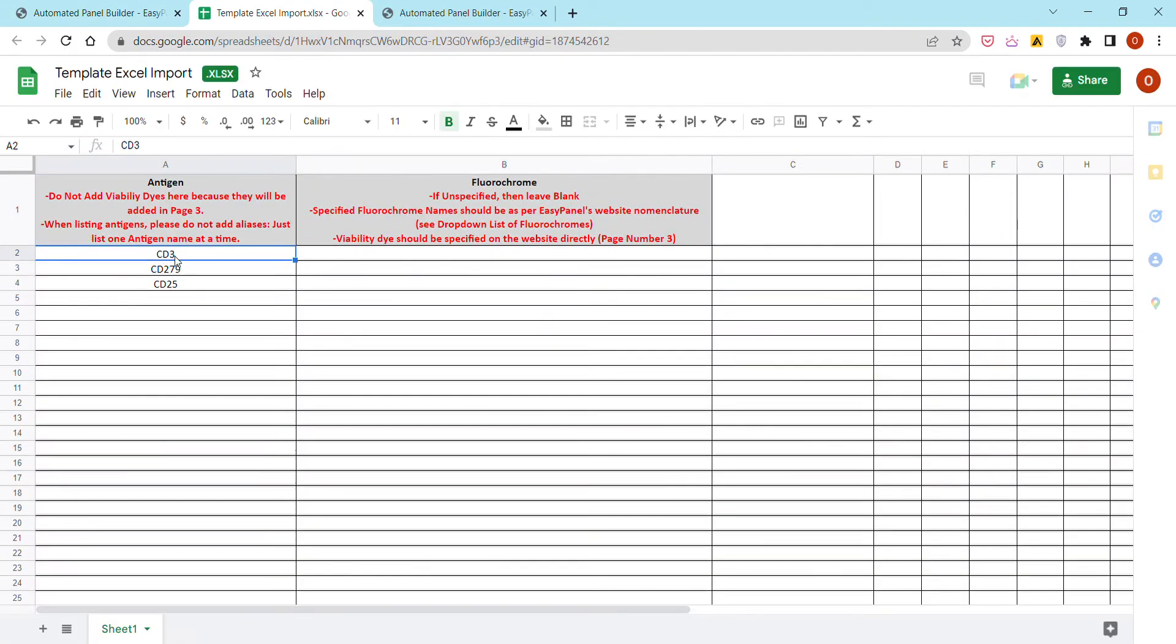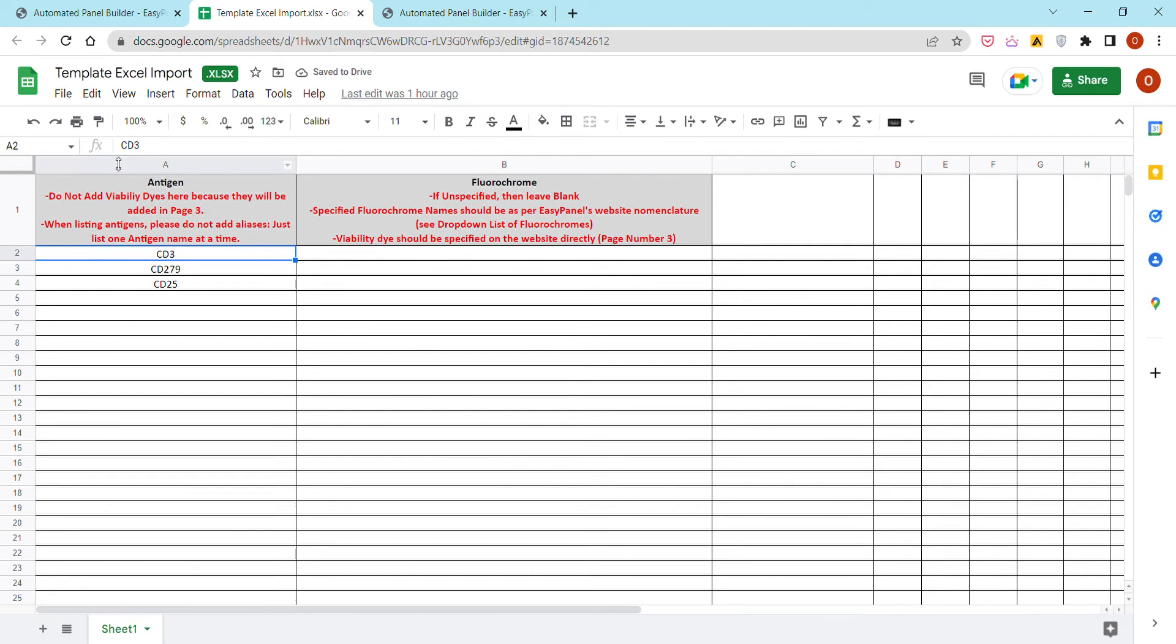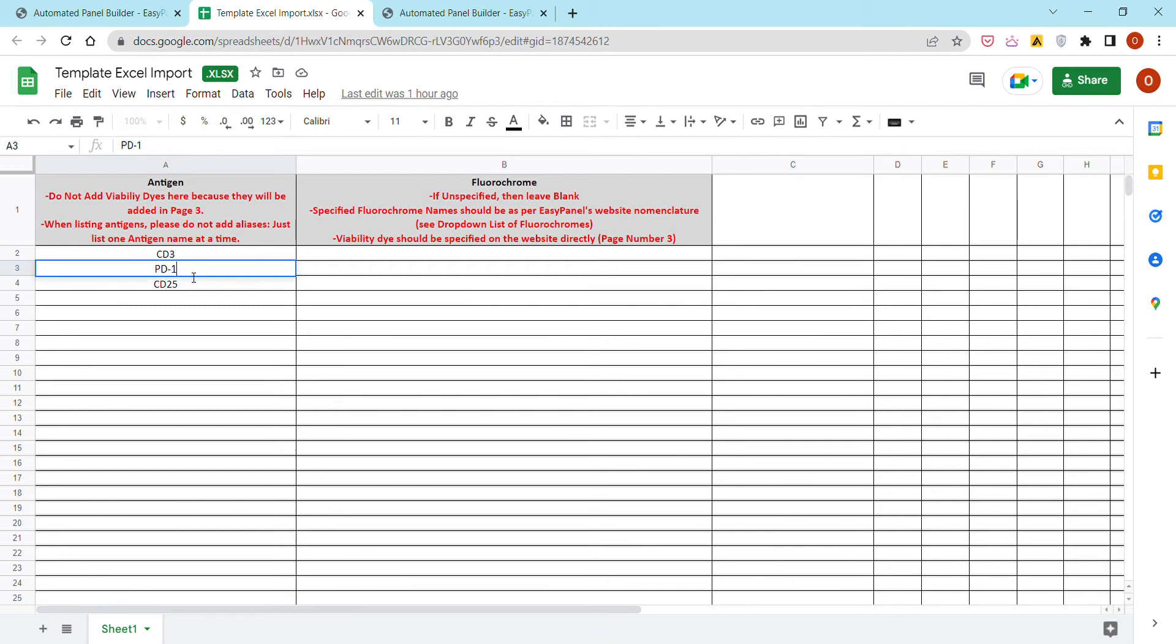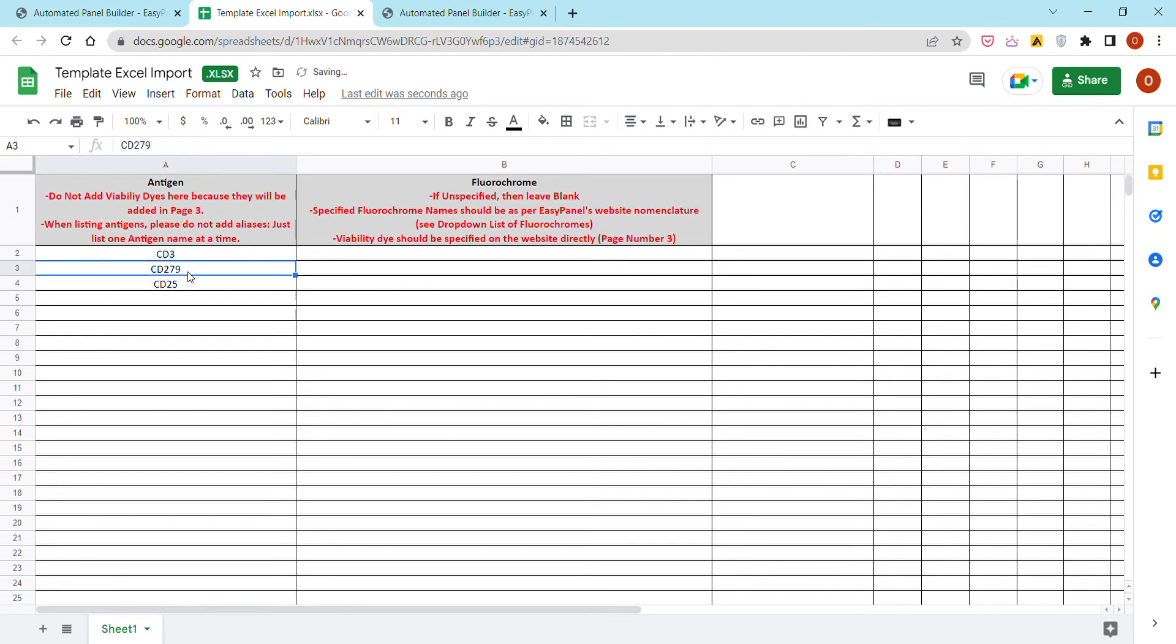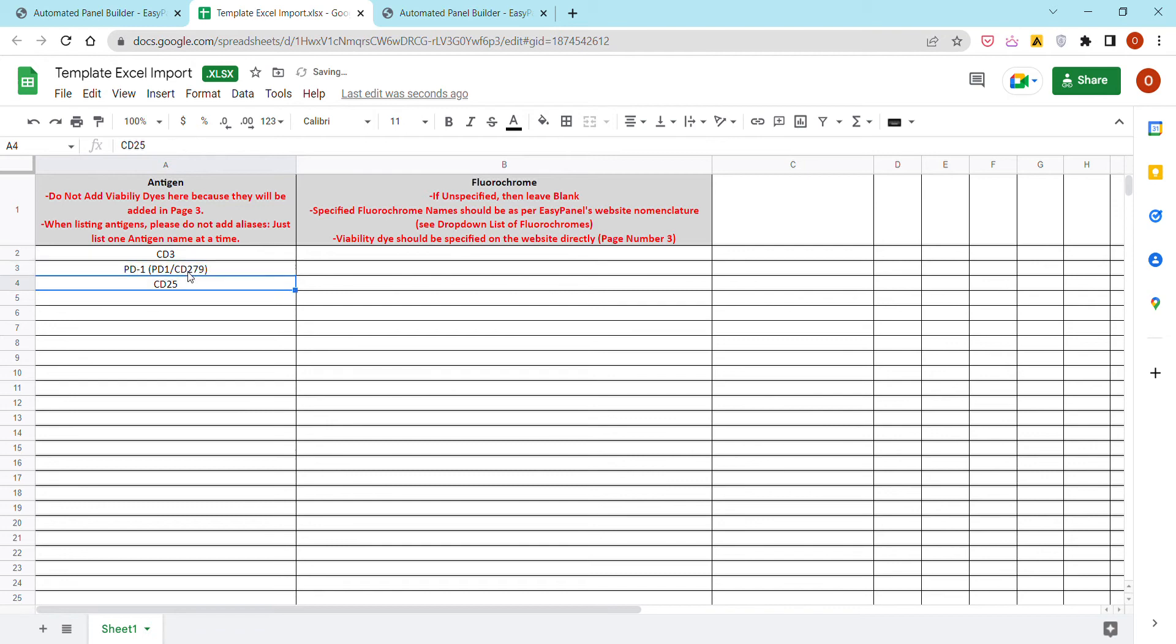One important comment when using the Excel or CSV template: please do not add different aliases of the same antigen. For example, for PD1 you can put PD1 or CD279, but please avoid entering PD1 parenthesis PD1 slash CD279, because in this case the algorithm would not recognize the antigen.